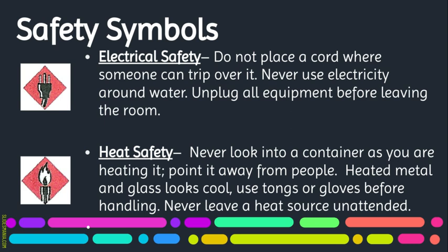Heat safety. So that's a picture of a Bunsen burner. We aren't going to be using Bunsen burners in middle school. Generally, you start using them in high school chemistry. We will use hot plates. They are kind of similar to the top of a stove. So they can get hot. We can boil things. They get pretty hot.